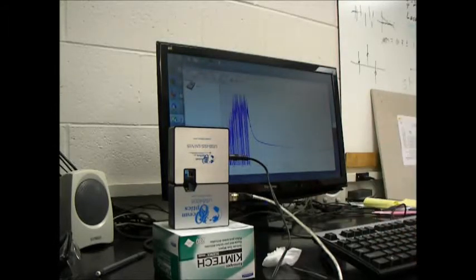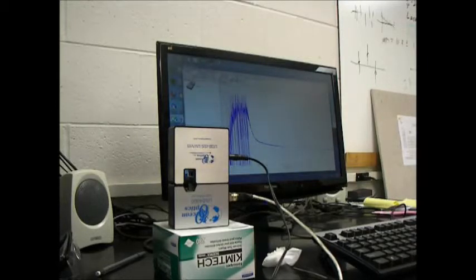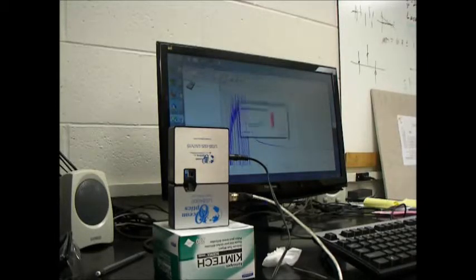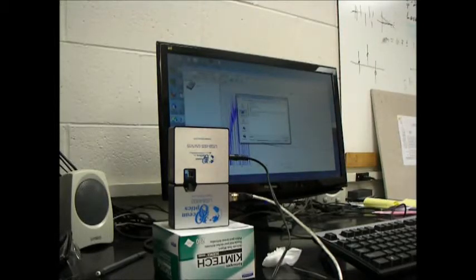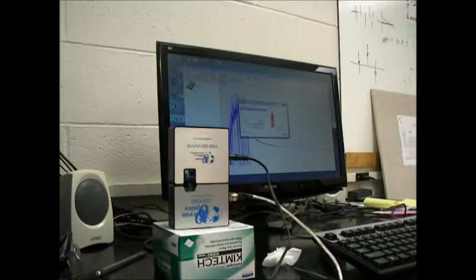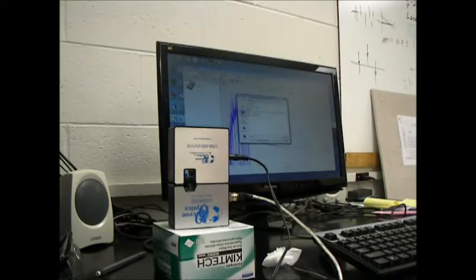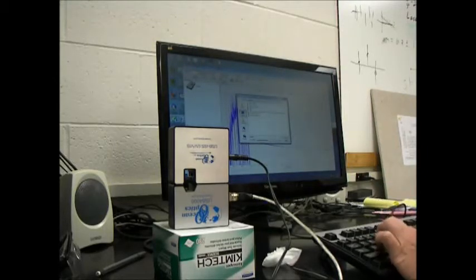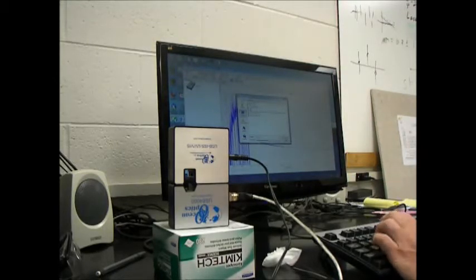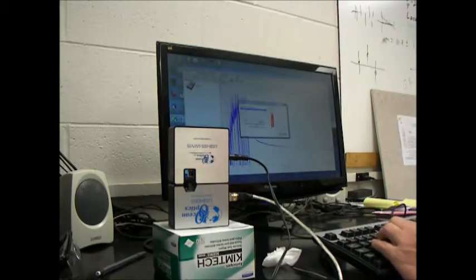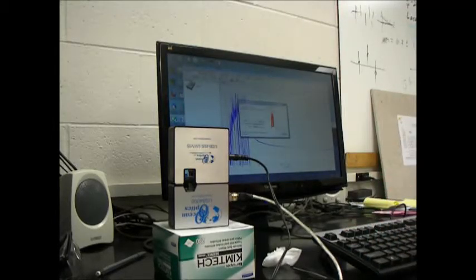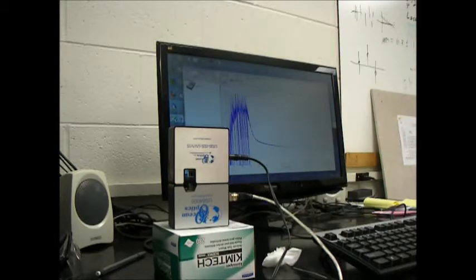Next, you can go to the next sample. Let's say I swap it out and hit Play, Pause. Now I click the Save button again. You browse to where you want to save it. Call this Test Sample 2. Click Save, and then you have to click Save again.